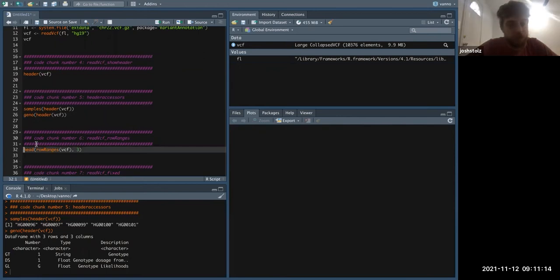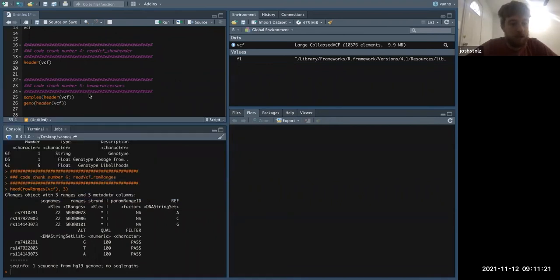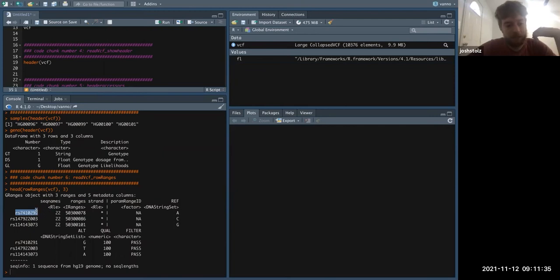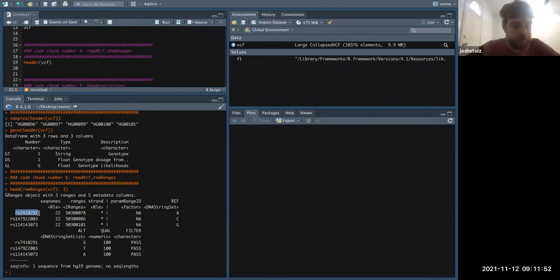We can look at the row ranges — most of you are probably familiar with how row ranges are set. Looking at this, they have the RSID just as the ID connecting the row ranges, and I'm thinking maybe that would be better in the future for our BCF. Right now we just have a concatenated ID. This is just like a RangedSummarizedExperiment — it works in a very similar way where you can subset the data.